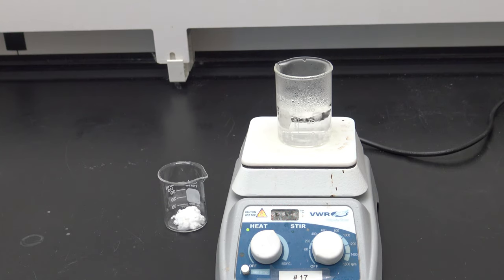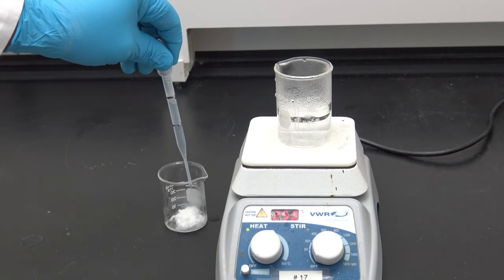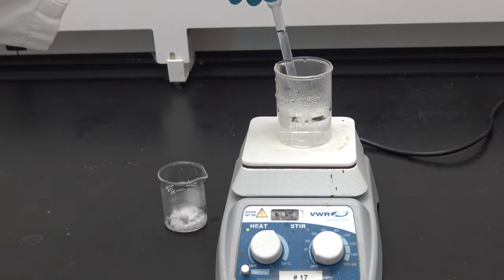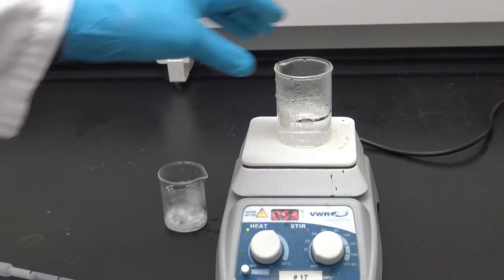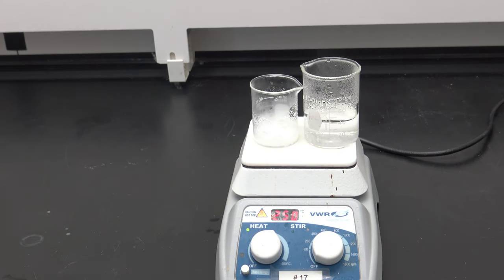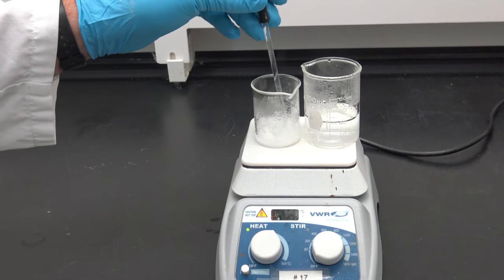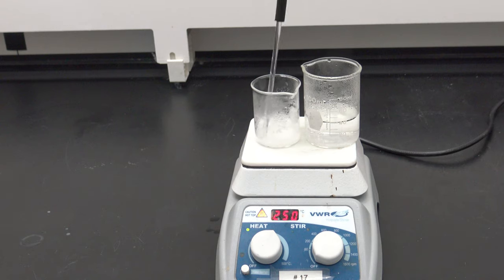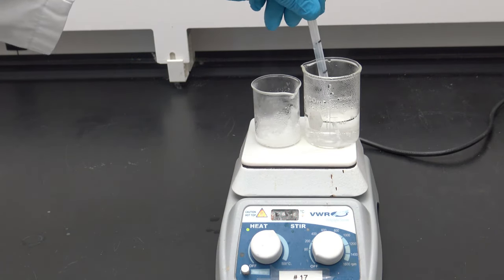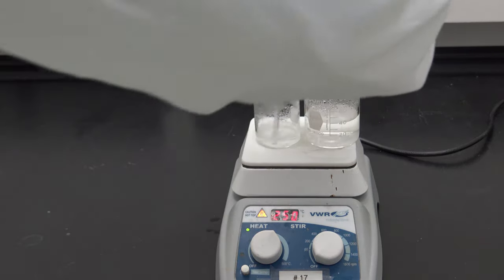That's based on the theoretical yield and the solubility of salicylic acid in boiling water. I'm now going to add my 4.5 milliliters of boiling water, and then I'm going to put that on the hot plate and stir it around. It looks like I'm going to need some more, so I'm going to add approximately 2 more milliliters and stir it around.